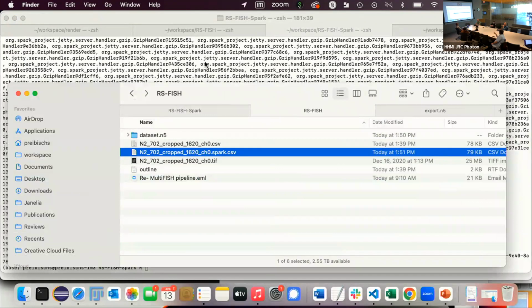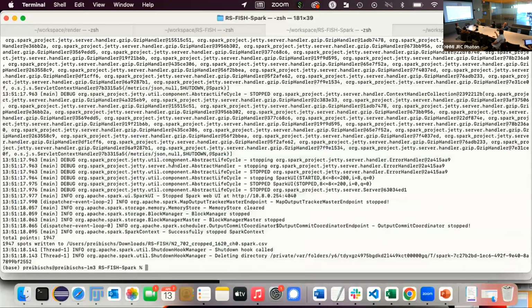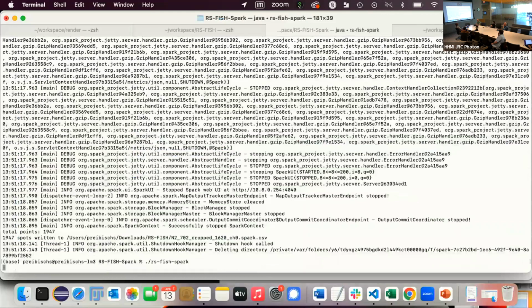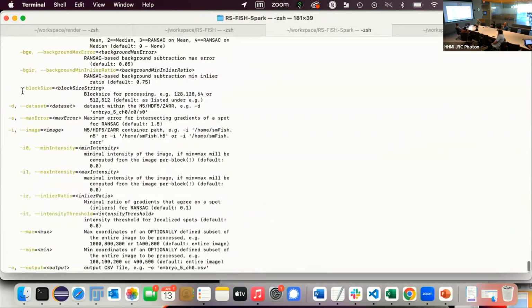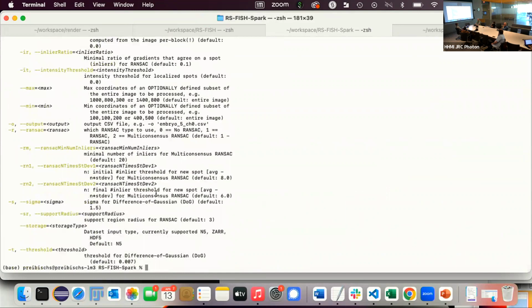Was it parallelized, or not? It's based on the block size that you're using. Where was that specified? It does something by default, but I think you can also define it. Yeah, you can set the block size as you want. But by default, it will use the block size as you saved it. Then you can say, I want bigger or smaller, as these are sometimes performance considerations.